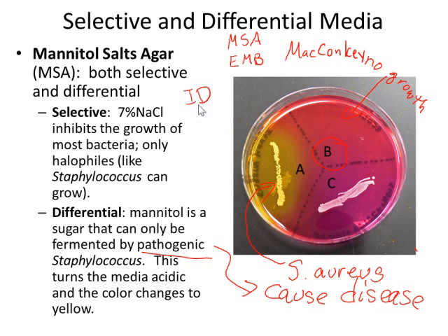And so in a case study, I'm going to use selective and differential media in order to figure out what's causing a food poisoning outbreak, or what's causing a rash outbreak due to a hot tub that's contaminated. I mean, I can set up scenarios in which I identify organisms using selective and differential media. So I really strongly suggest you go listen to that virtual lecture.